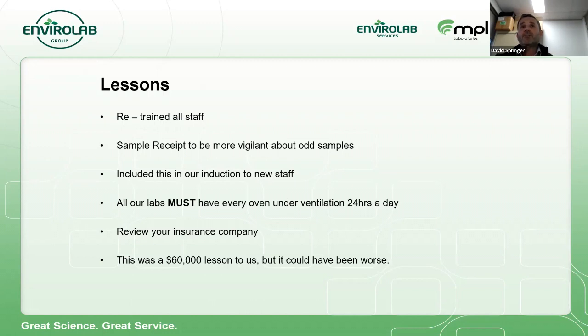And one of the most important things that came out of this was that every oven in all of our laboratories must be under ventilation 24 hours a day. This particular oven wasn't, and that was something we missed early on. So it was a very expensive lesson, but we are quite happy that this happened because it did teach us so many things.